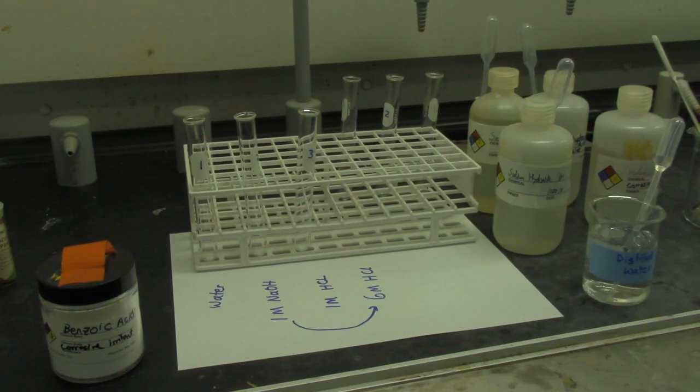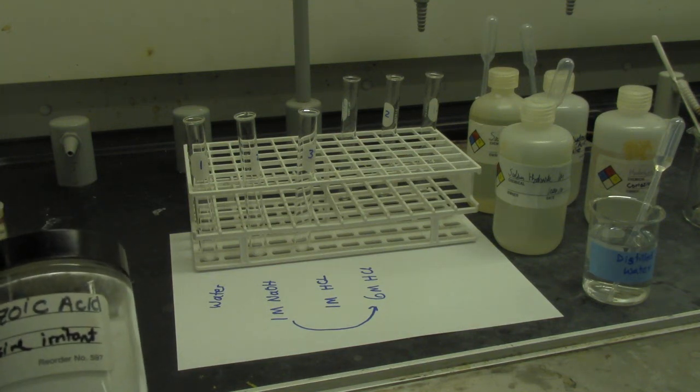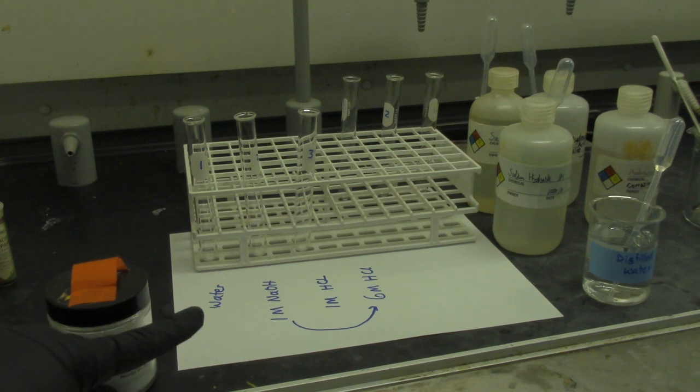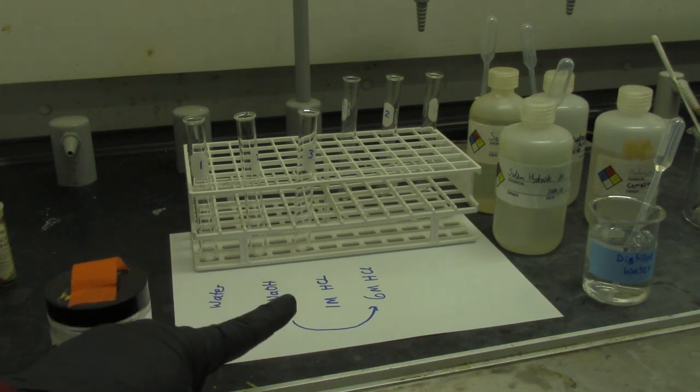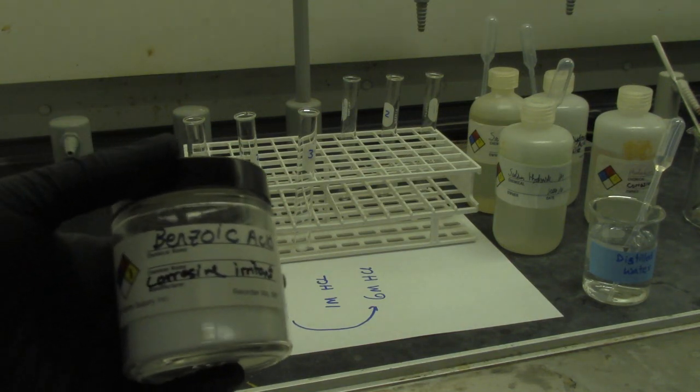So in part D, we will determine the organic acids and bases solubility in 3 different solutions: water, sodium hydroxide 1 molar, and 1 molar hydrochloric acid. The first thing we will do is with benzoic acid.